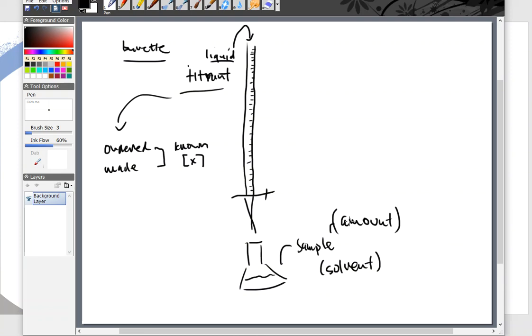When I say that, what I basically mean is that if you go back and remember the wine titration that you did, you pipetted a certain amount into the flask. Well, it didn't go anywhere, did it? It stayed in the flask. But we allowed you to add water to that sample. Well, you did dilute it, but 5 milliliters or 10 milliliters, whatever you decided to use at that point, it was still 5 milliliters of sample that's still in there. It's still 10 milliliters of sample that's in there. You did not spill any of it. It's still in the flask.